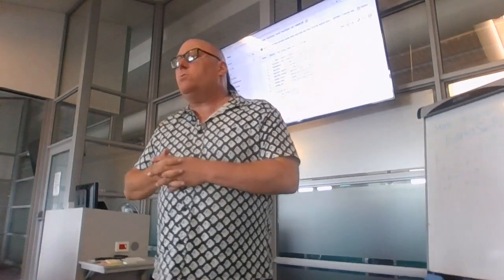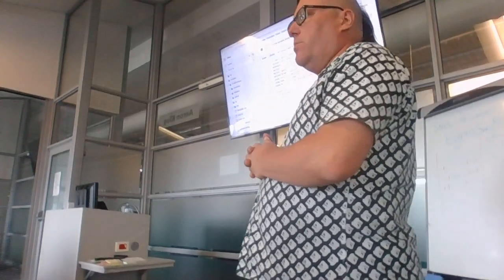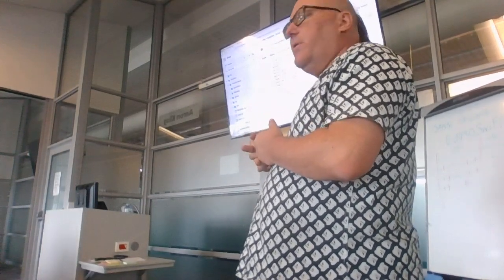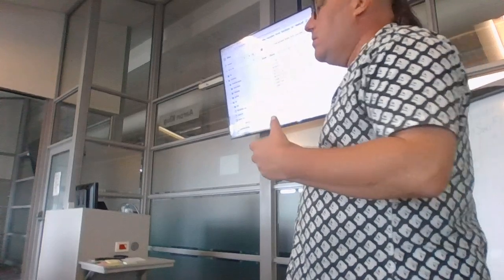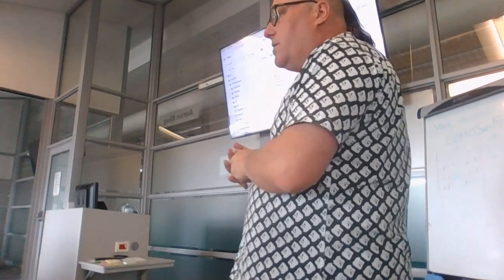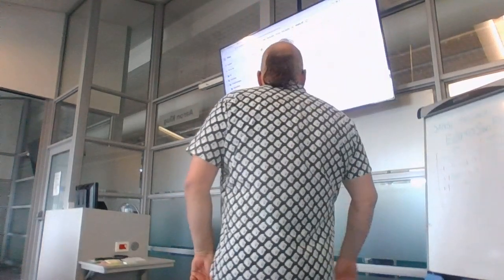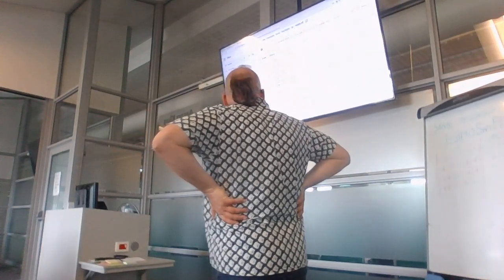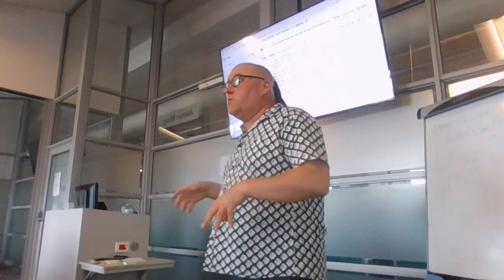Now I've tested these tools with all 3 options. My experience is that Conda is error prone. For this tool, it actually works. But for other of the Bactopia workflows, it has problems finding all the necessary things with Conda, okay? Then I tested it with Docker and with Singularity, and both of those container systems work. They download the containers and they run the software from the containers, okay? So, to me, if you're running things on an individual machine, I find that Docker, if you can use it, is the easiest system to use, okay?